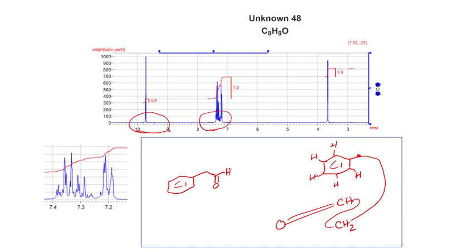Double check. We have the aldehyde H around 9.7. Perfectly fine place for an aldehyde hydrogen. We have a CH2 coming very nice, pretty sharp peak at 3.6. By the way, if we blew that up, we would find that that is not actually a single peak.